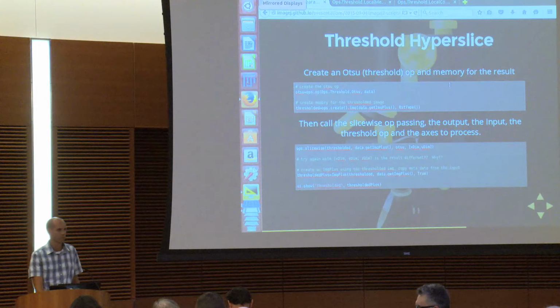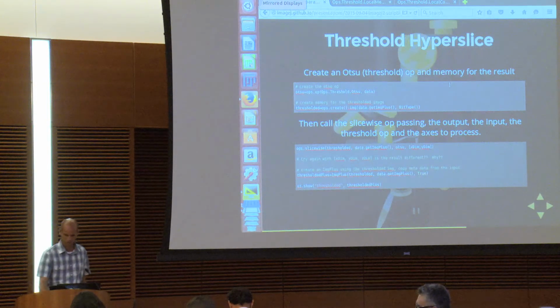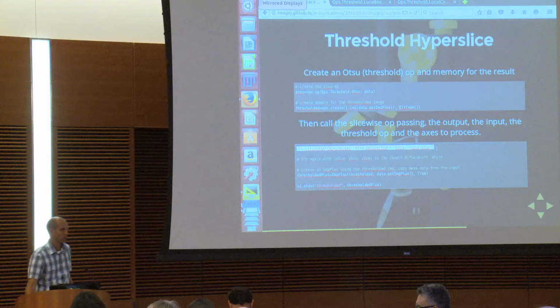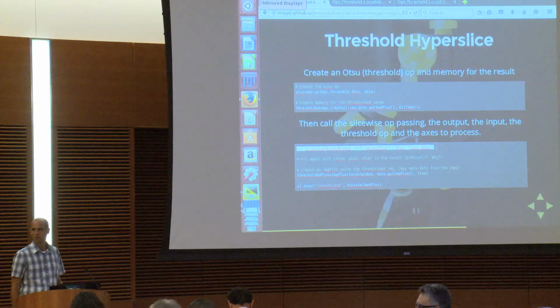Loop's a bad example actually. Slicewise is kind of like that, because slicewise is a loop. There's a loop op, and there's another one called map. Map is like the coolest example, which is I have an op that works on a single number and I want to do it on an image. So that's the number one use case. I should have just started with that.